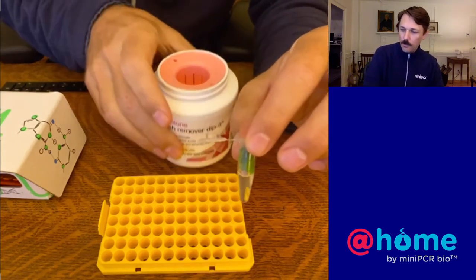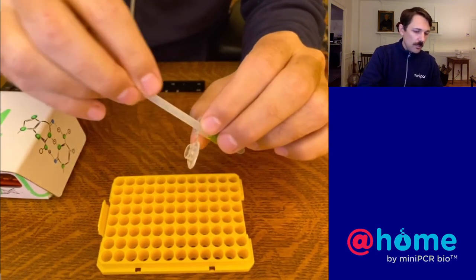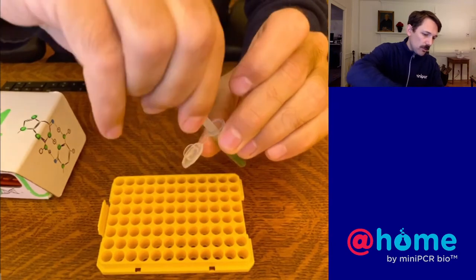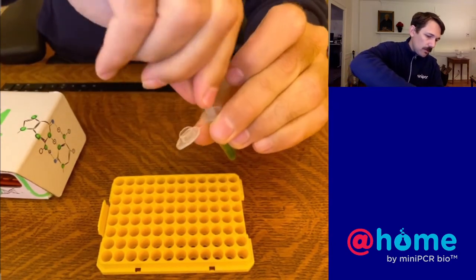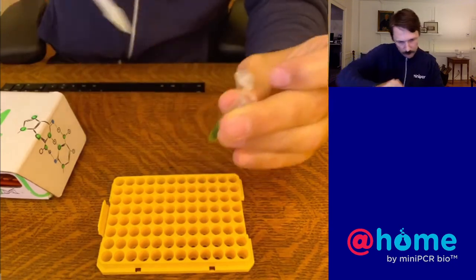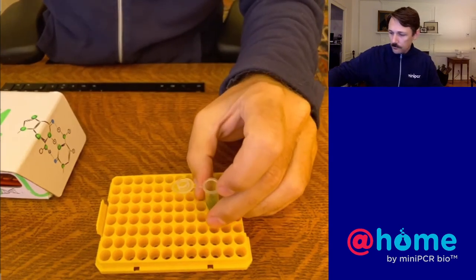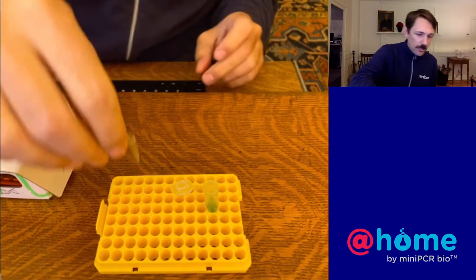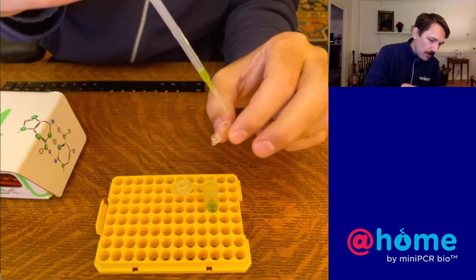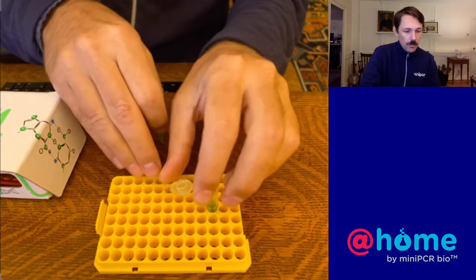So there we go. And then I'm going to use my plastic grinder that comes with the activity to just mash this up. You just put it in, twirl it around, and you'll see that this is going to start turning pretty green pretty quickly. So there we go, some nice green color there. So next I'll take just an empty tube, and I'm just going to, again, use my transfer pipette to add some to this tube just till it's about half full. Perfect. I'll cap this up, and we're done with this right now.